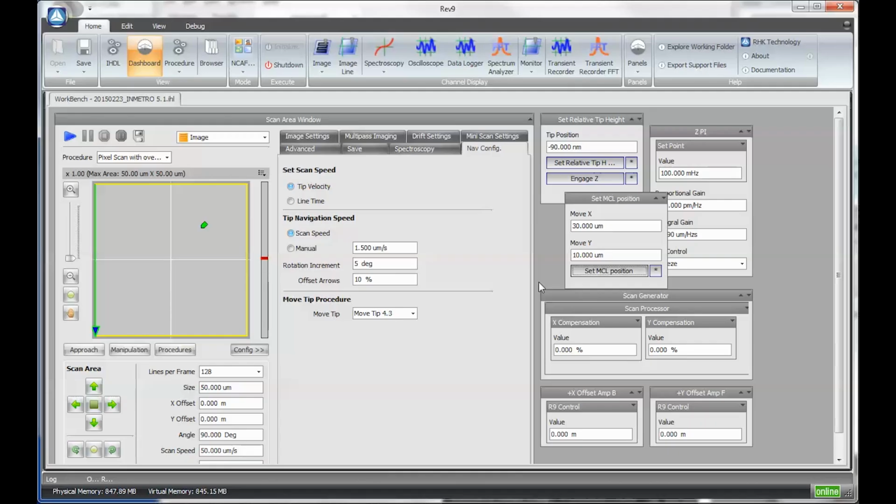R9 procedure space, as well as add custom control panels to handle the proper functionality. Well, that's all for this quick little tutorial. I hope you learned something, and please give me some feedback if you have any questions.